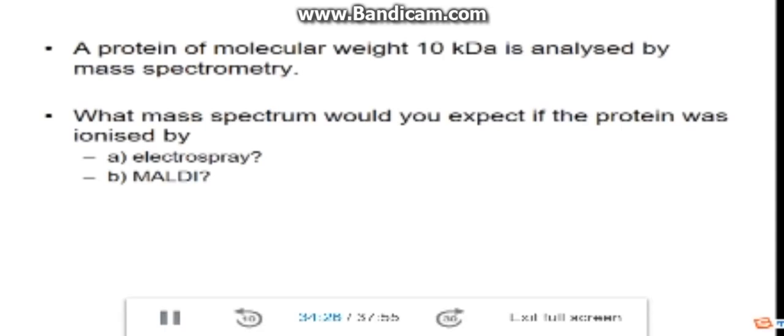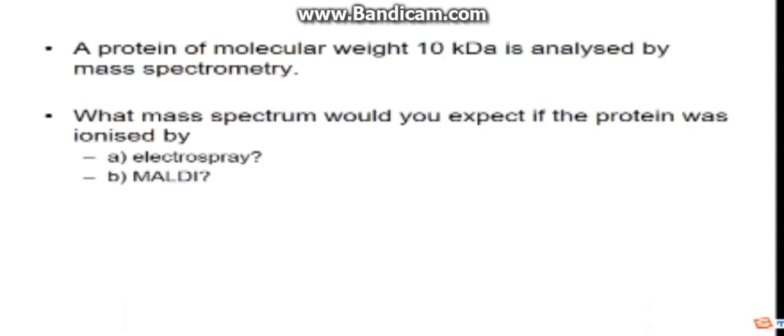If you want a higher resolution instrument, it'll have a restricted mass to charge range. Then you'll have to use electrospray, because most analyzers will go up to, say, 1,000 or 1,100 mass to charge, but not many of them. Really only the time of flight will go up to 10,000.